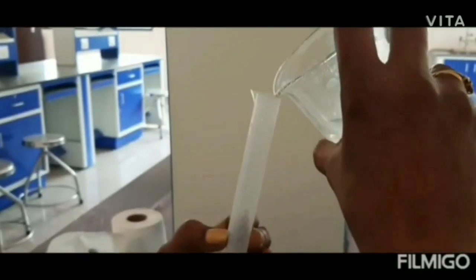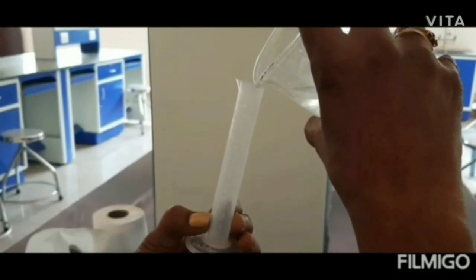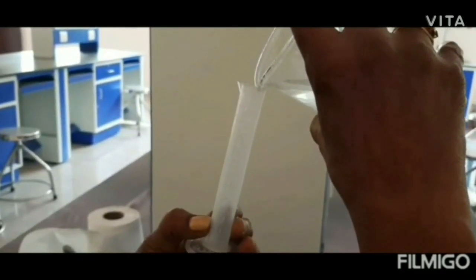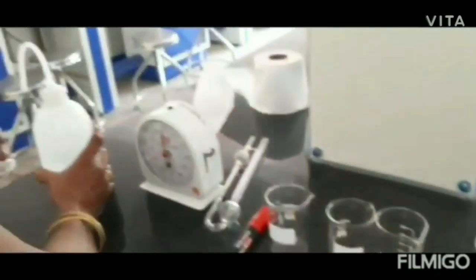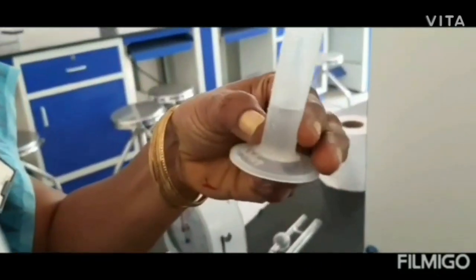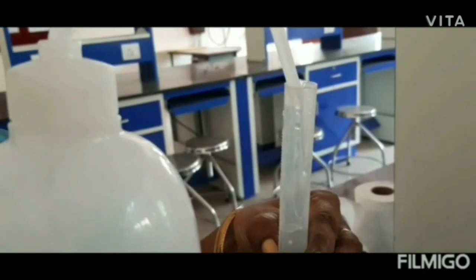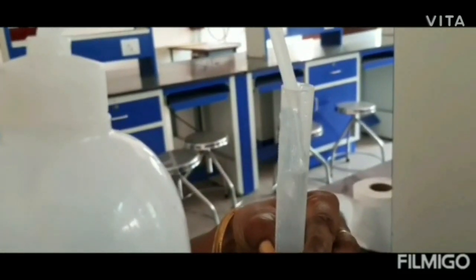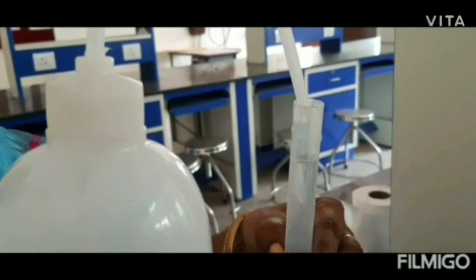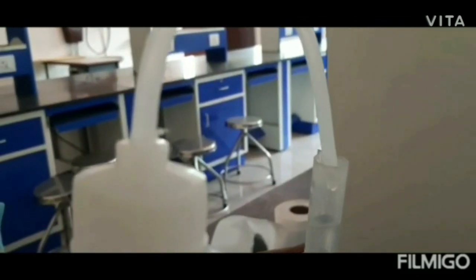Step 2 is the preparation of various concentrations. Now I am preparing the 0.2 concentration. For that, 2 ml of 1% PVA solution is taken in a 10 ml measuring jar and made up to 10 ml. That means 2 ml of 1% PVA and 8 ml of distilled water is added to it.